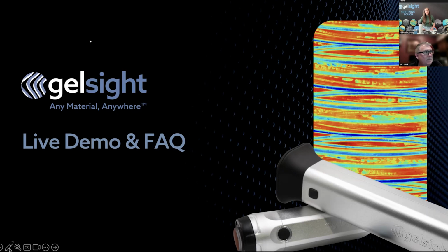Okay, great. Next question. Is there any flexibility in the probing system? Can we make it like a roller for fast scanning of large areas? Well, we don't have something like that now, I guess. So, maybe one day, right? Next question. For larger surfaces, is the GelSight system capable of stitching the images? I can answer that. Yeah, go ahead, Pat. At the moment, we cannot, but let me just say, keep an eye out for something coming very soon.